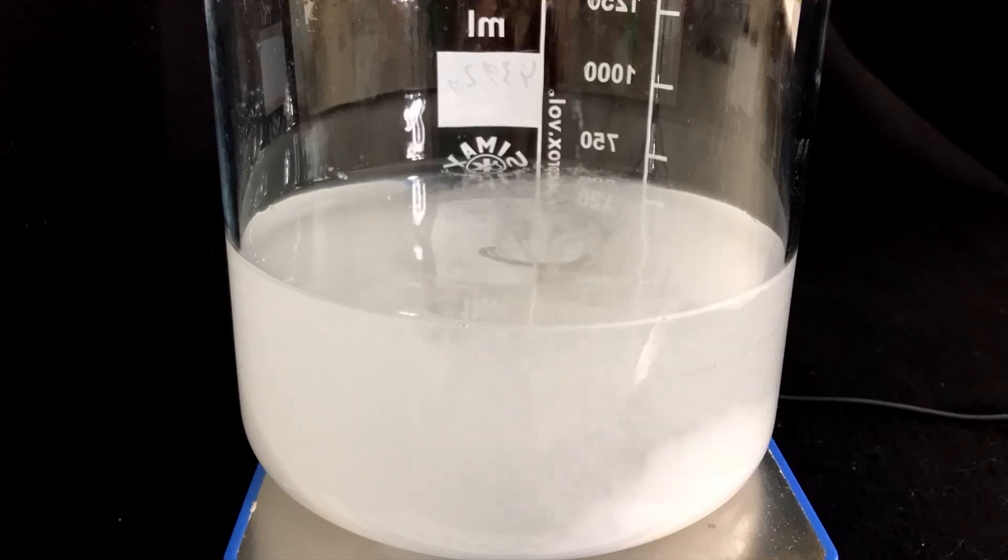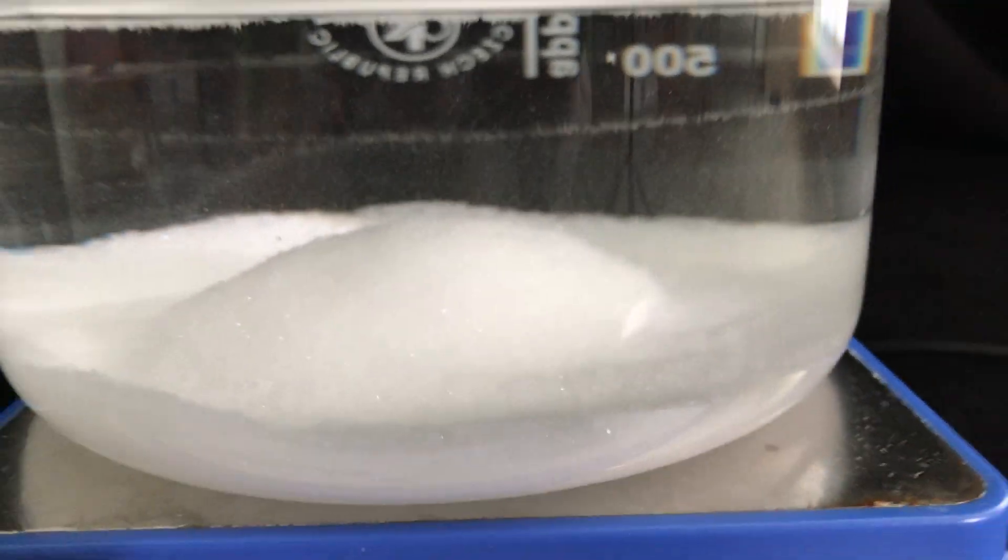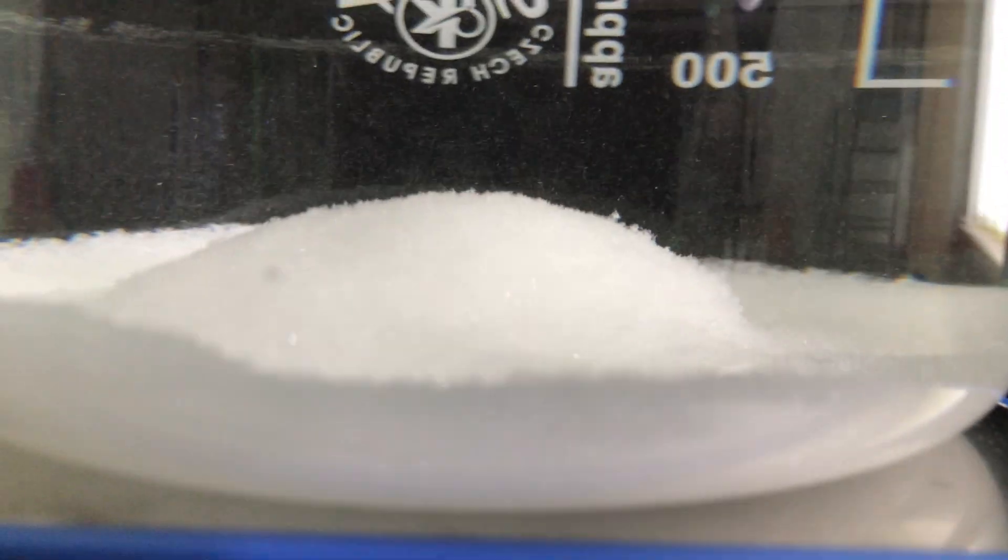The magnetic stirrer was turned off and fortunately mercury thiocyanate quickly settled down. Mercury thiocyanate is a white fluffy powder. The next step is going to be to separate it from the liquid. As the powder is really coarse and I don't want to contaminate my vacuum filtration setup, a gravity filtration should suffice.